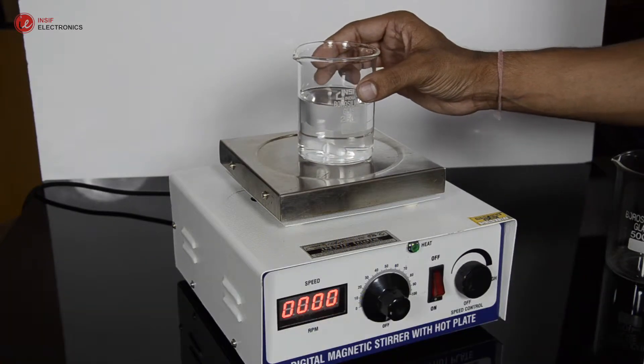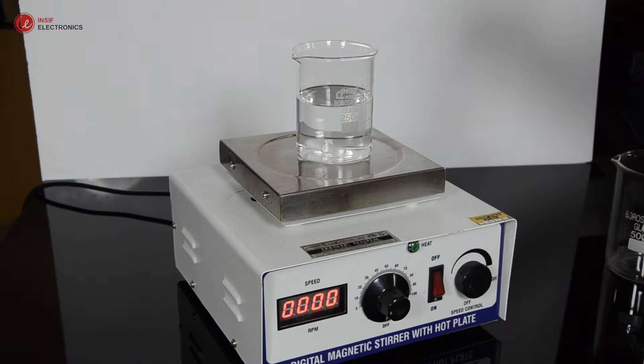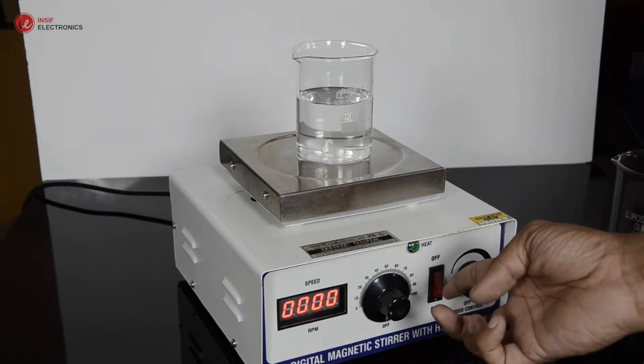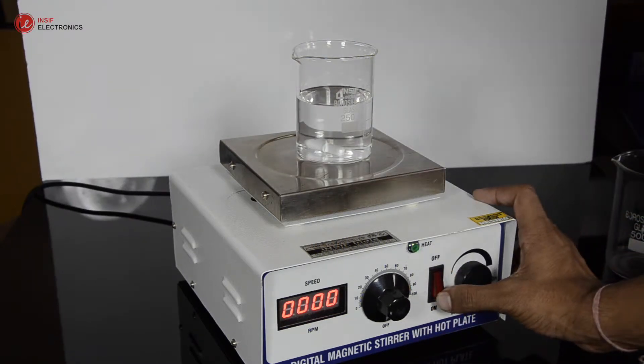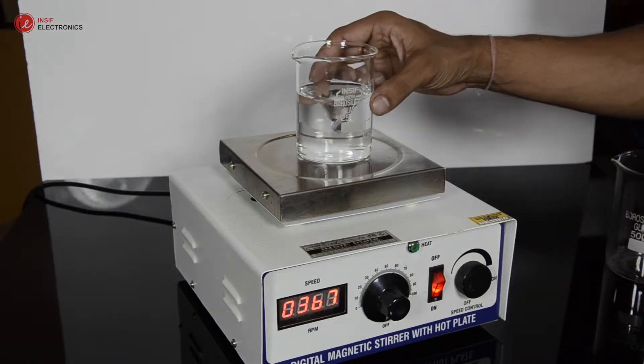A stir bar is immersed into the liquid, and the device generates a magnetic field as it causes the bar to rotate, thereby generating the vortex stirring of the liquid.